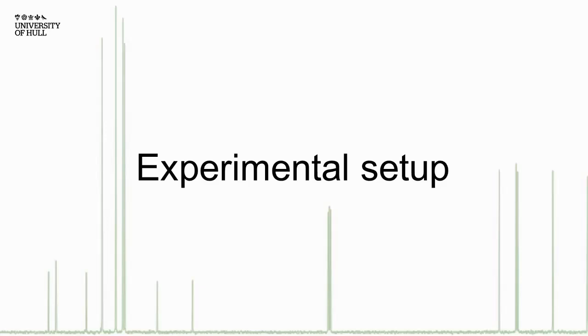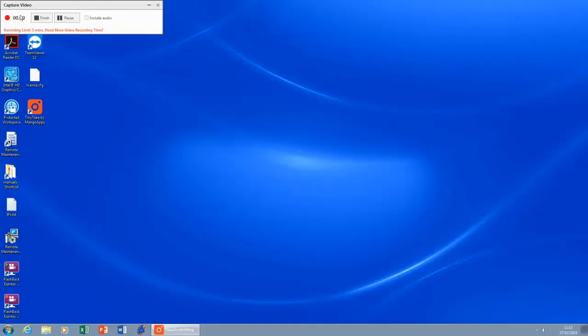This will only work if the correct probe has been inserted. Contact a technician if you have any questions on how to do this, and please do not attempt to swap the probe yourself. Once we know the correct probe is in the NMR machine, we need to switch modes.